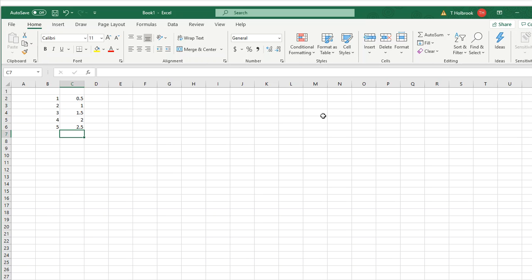How do we use this data to make a graph in Excel, which makes my life a little bit quicker, a little bit easier because I'm using technology to my advantage? Well, here's how you do it if you've never used Excel before. So after I key in what goes on my x-axis, which is mils, and my y-axis in the next column, which is gram, I'm then going to click and I'm going to highlight the data. When I do this, Excel understands that it needs to keep the set of data together.